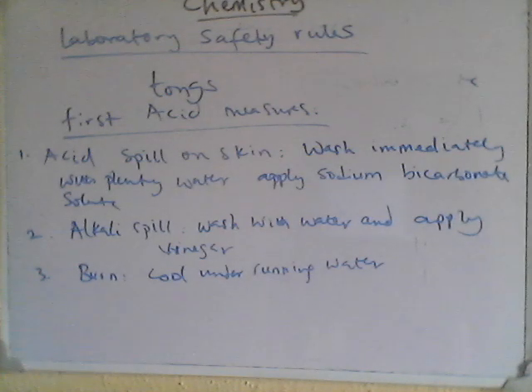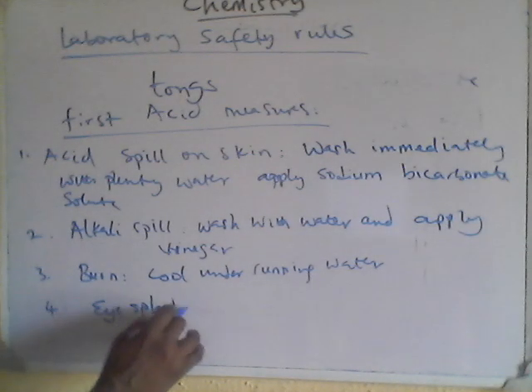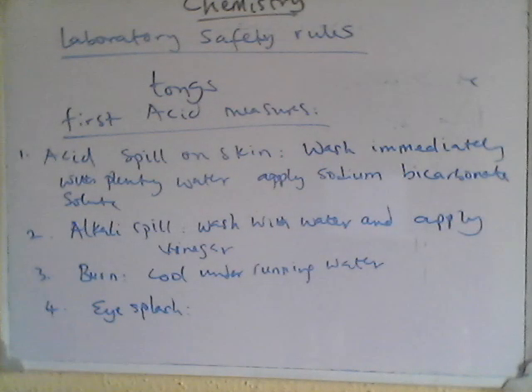A fourth common accident is an eye splash. If something splashes into your eye, quickly use an eye wash station or rinse with water for at least 15 minutes.